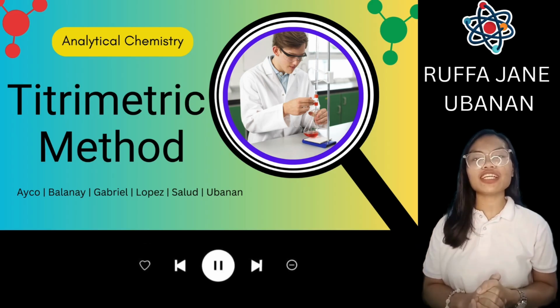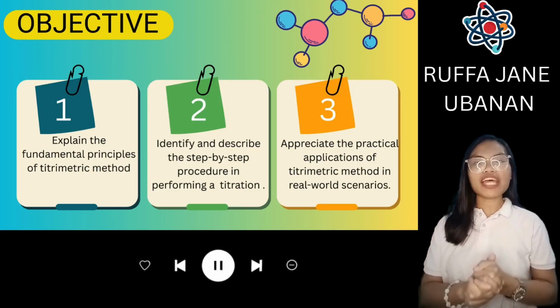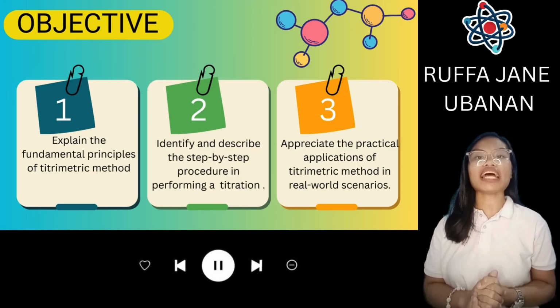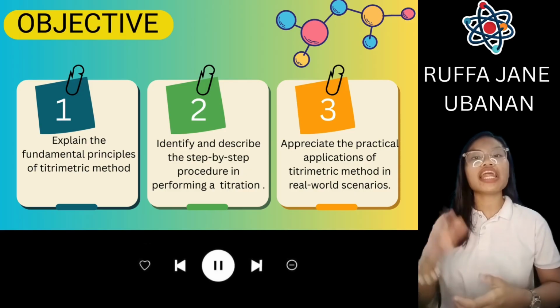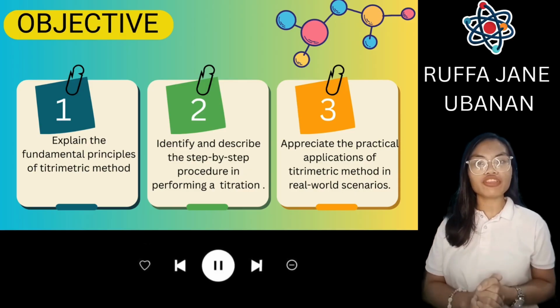Together, we will be discussing about Titrimetric Method. Let's begin with our objectives. First, explain the fundamental principles of Titrimetric Method. Second, identify and describe the step-by-step procedure in performing a titration. And third, appreciate the practical application of Titrimetric Method in real-world scenarios.